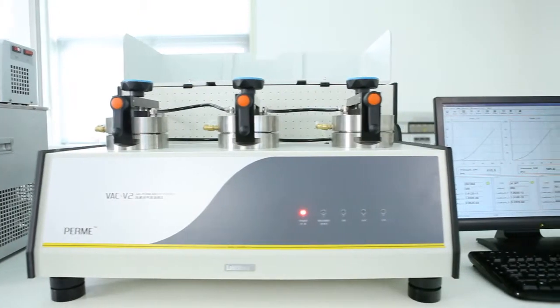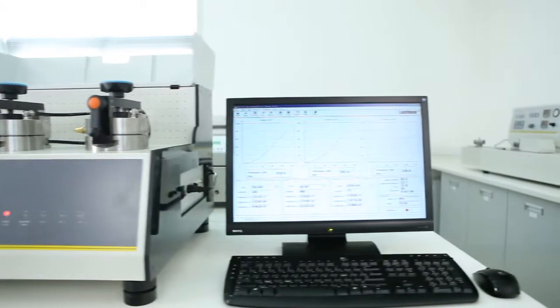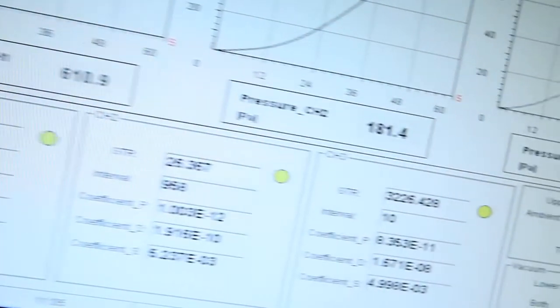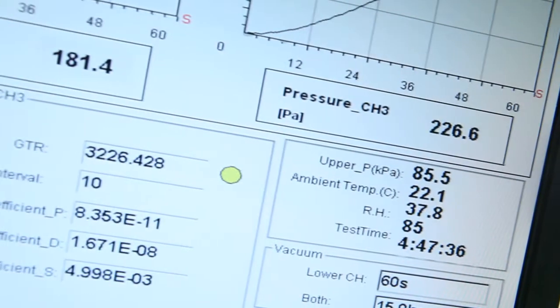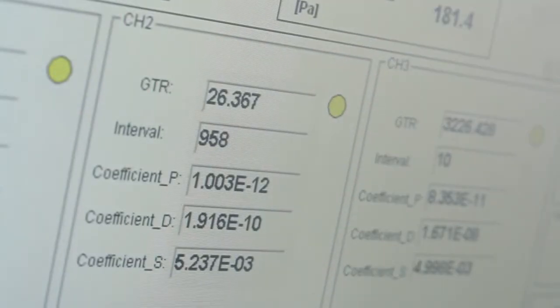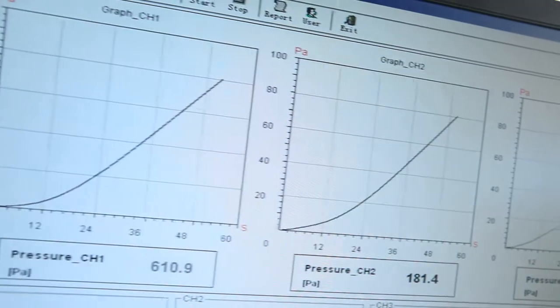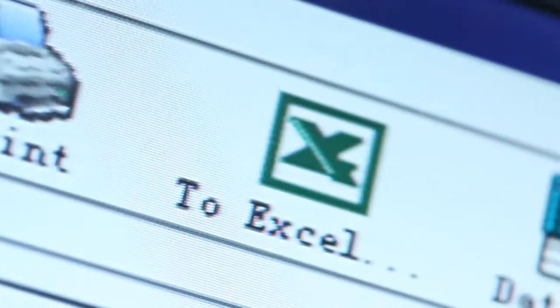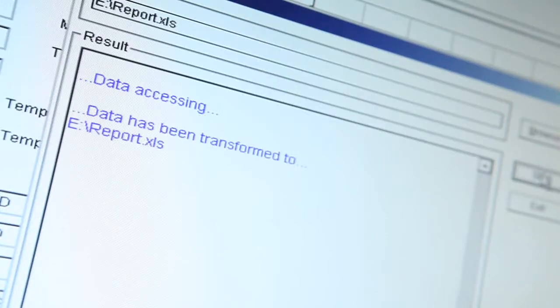The testing software designed by LabThink has a user-friendly operation interface and visual display of real-time data and graph which allows for the test process in all three chambers to be monitored simultaneously and the test data to be exported to Excel.